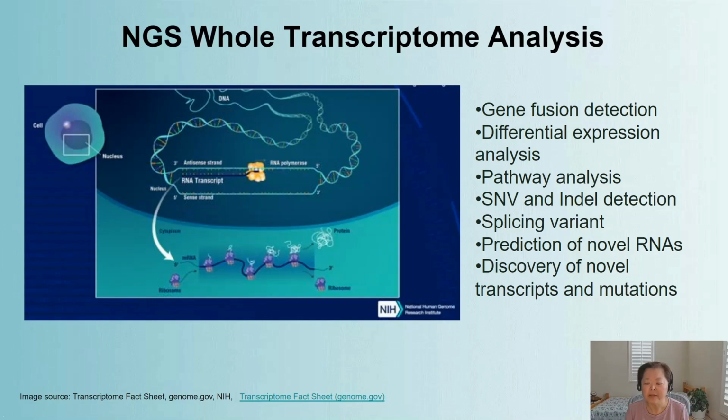To summarize, the qPCR method is a gold standard. It can quickly screen those target genes that have a clinical relevance. However, it can only detect genes with known sequence. In addition, what happens if researchers are interested in other RNA biotypes besides the messenger RNA?